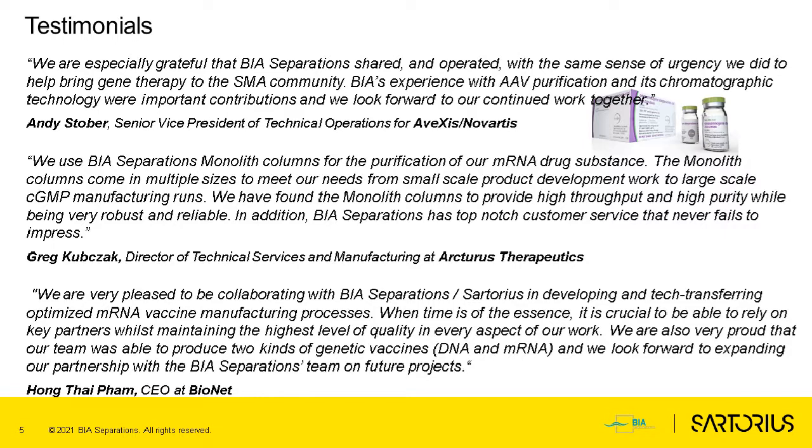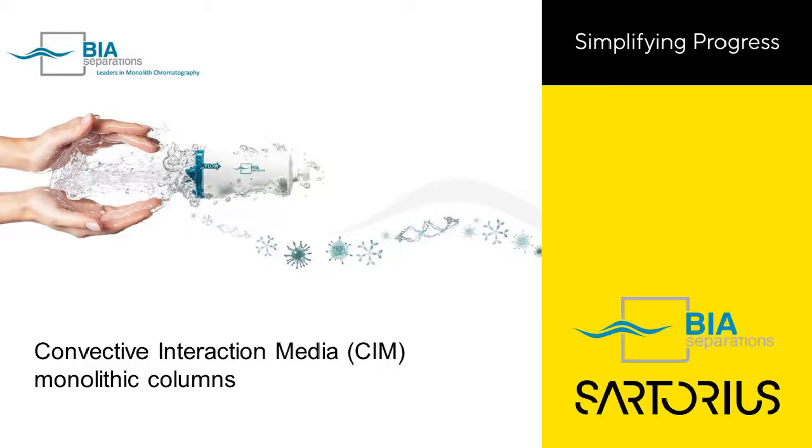So the complete plasmid DNA purification, IVT synthesis, and also purification of mRNA were all developed within just 6 months and tech transferred to the Bionet Asia production facility.